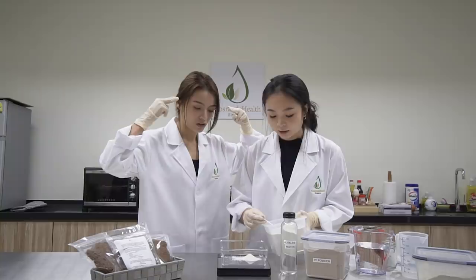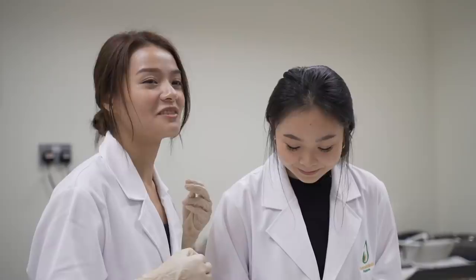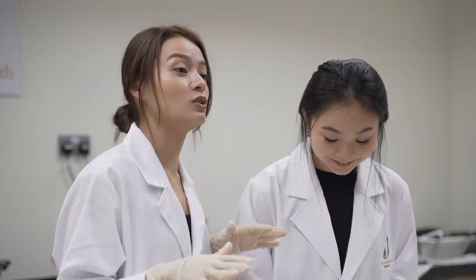Oh. Yeah, such that they don't really touch each other. And also on the same line of reason, it will be easier for you to rectify any mistakes you make in weighing. Yeah, exactly that. Wow, this one is really very different from cooking at home and experimenting, you know. Home one is, you know, agak-agak. This one is like, wow, I have to be super accurate.